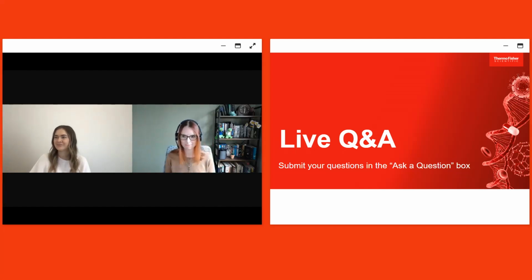Great, thank you, Zoe. Another question for you here. What operating systems do you support? With all installations of Chromeleon CDS, we provide what is known as the LOSI, the list of supported operating systems.